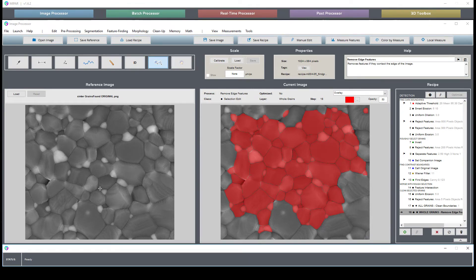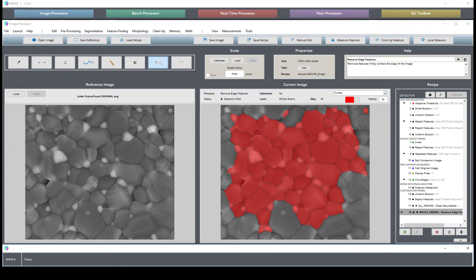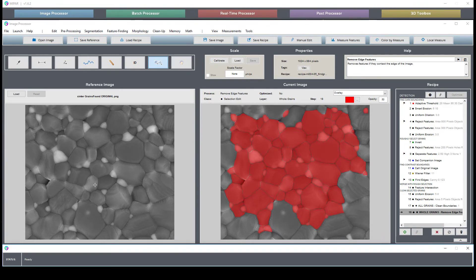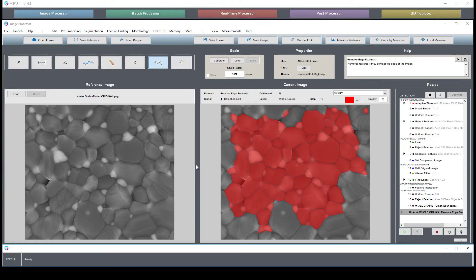If you find that your grain boundaries are not consistently dark, they vary from light to dark, and based on your etching and your specific sample, maybe look into running a standard deviation filter beforehand.